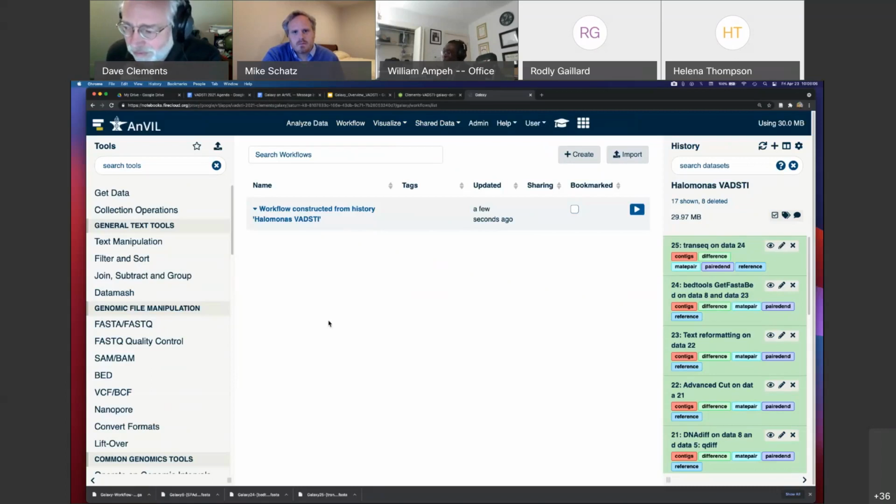You don't do much trial and error because it's going to cost you a lot of money if you run all trials of K to determine the best K, right? True. In this case, it's not a lot of money because it's a small genome. But if you're doing human, 3 billion bases, yeah, it's a lot.